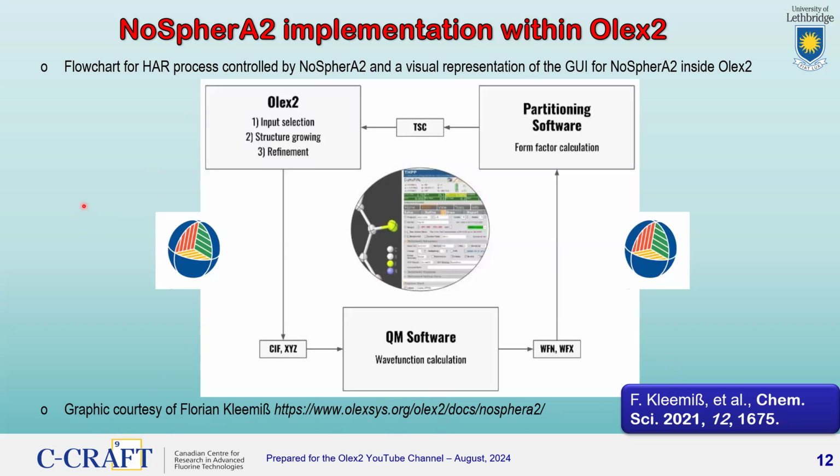So what we have here, in this box, is OLEX2 itself. And this can simply be a conventional crystallographic refinement engine working here. We can be using SHELXL, or OLEX2 Refine, or some other refinement engine that is doing standard refinements using these spherical atom approximations.